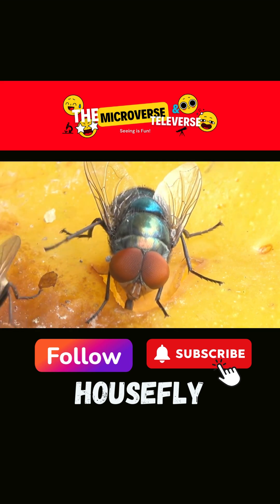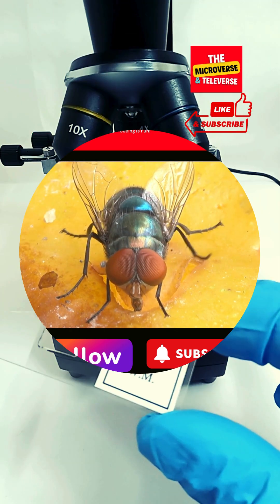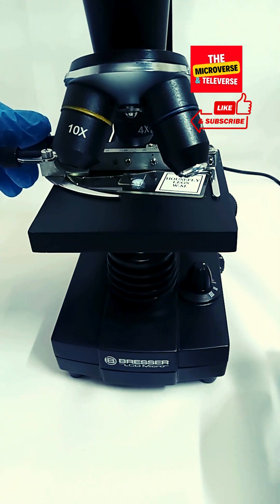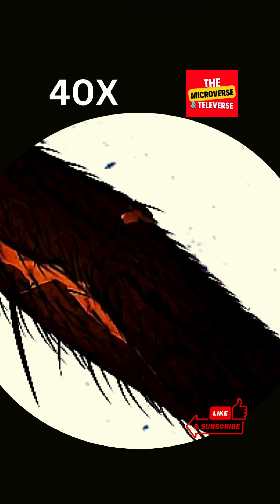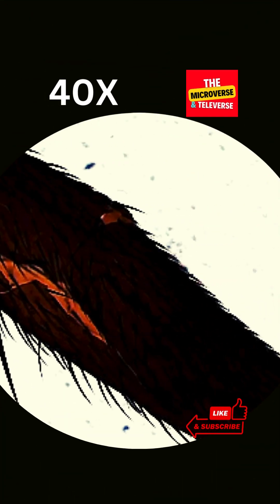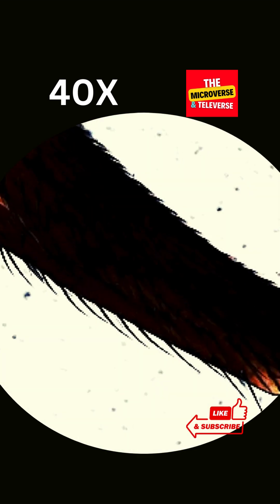Today, we're exploring the intricacies of the housefly leg through a microscope. Observing it at this scale reveals a realm of intricate design and remarkable functionality.